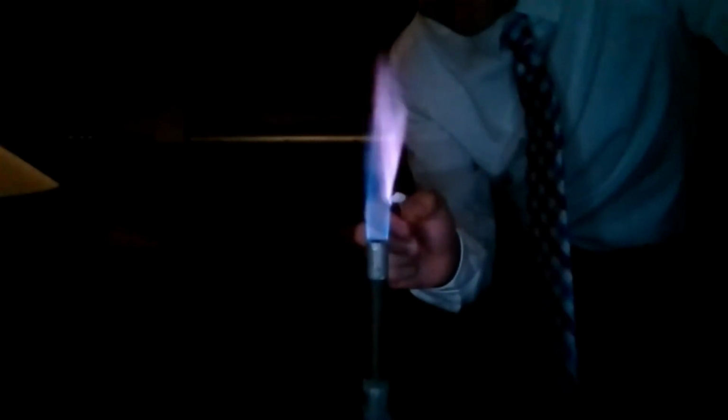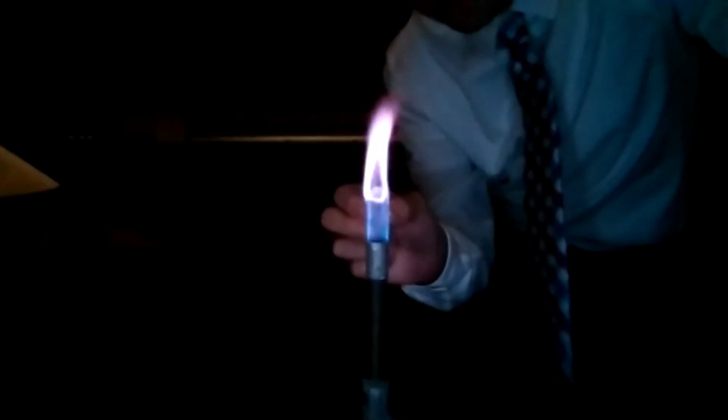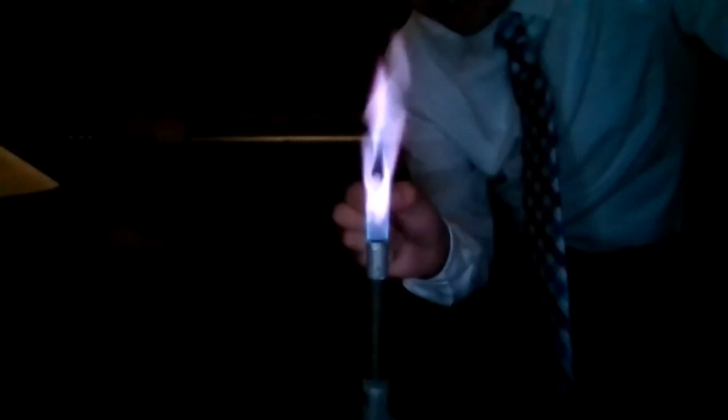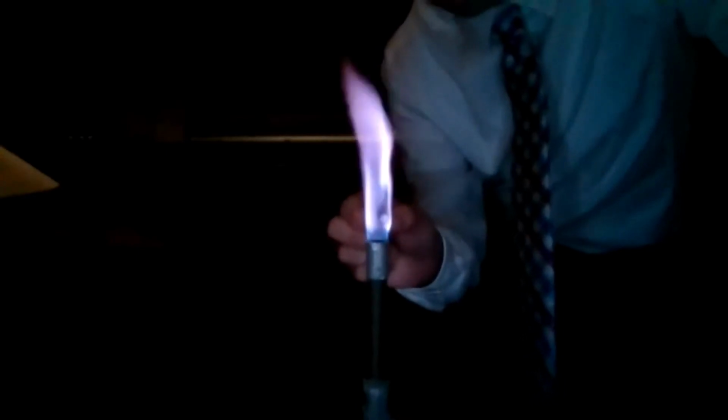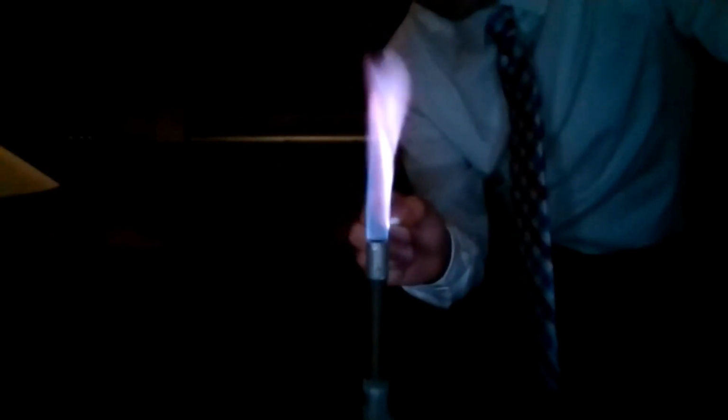Why is it potassium? How do we know that this is potassium? It's turning purple. That's why. Yeah, it's turning purple. And we know that whenever it burns purple, out of the ones that we looked at, that is potassium. Now, just for funsies, because you know this is fun, we're gonna do one more unknown.